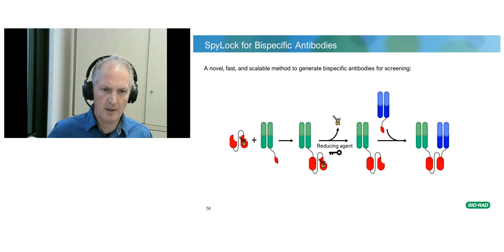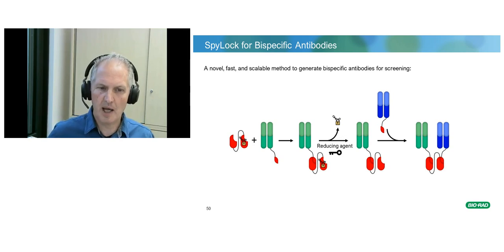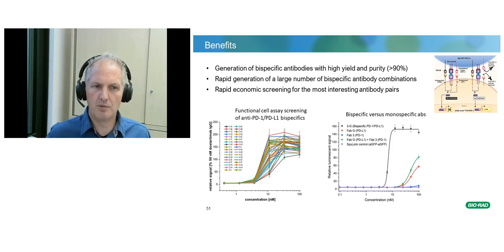So it works very nicely. We get very pure bispecific antibodies, and it can be done in high throughput. And we have applied this for the generation of PD-1, PD-L1 antibodies.